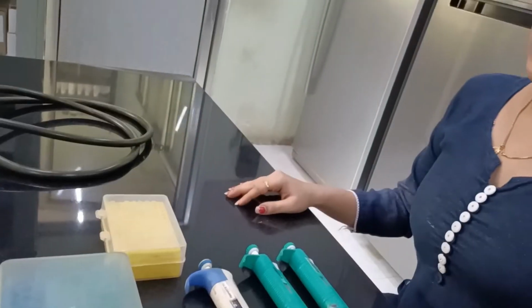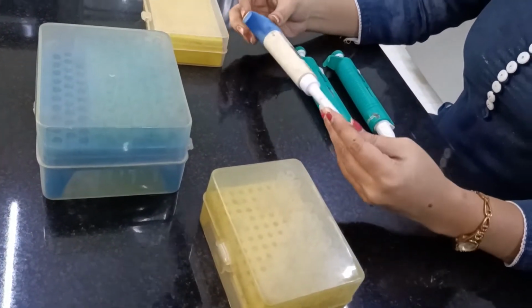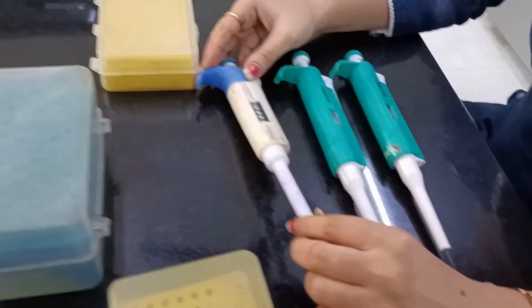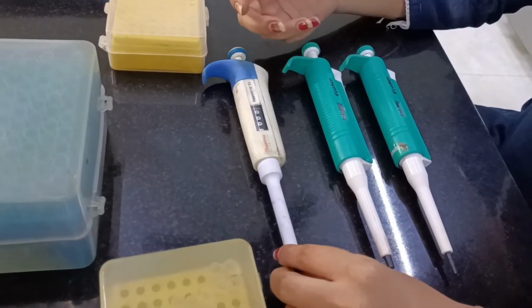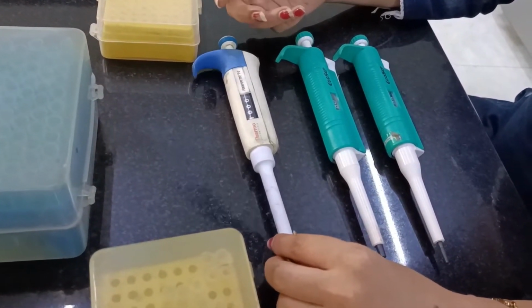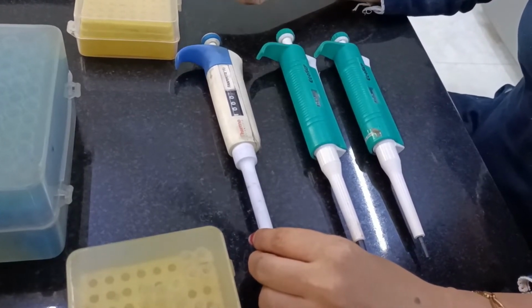Today we are going to talk with respect to micropipette. These are micropipettes. Micropipettes are basically a laboratory instrument which have been used to pipette out and withdraw a liquid sample from one container towards another container.